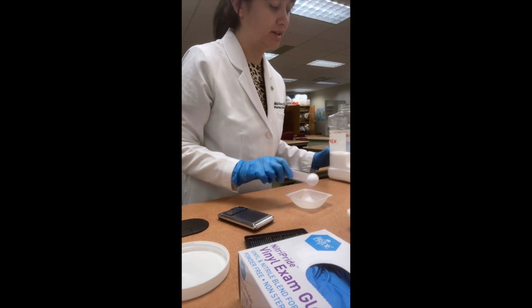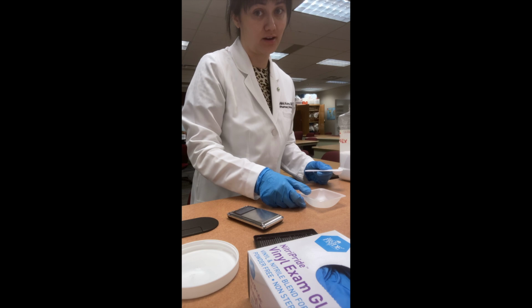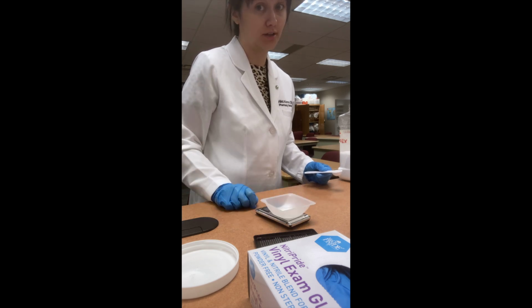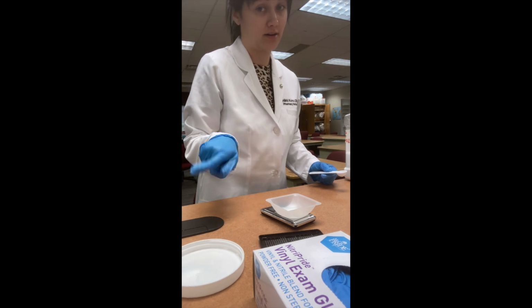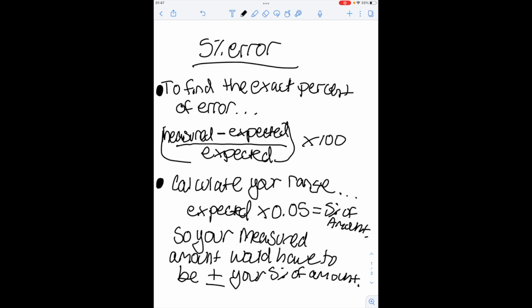I'm going to try to get it to the amount of salt that we want with a 5% error. Okay, that's really close, so that's within the 5% error range. I'll show you right now how to tell if it's within that 5% error range. When compounding in pharmacy, you always want to make sure that your products are within a 5% error range. It could be less than that depending on what the pharmacist wants, but a general rule of thumb is that you should be within 5% error.